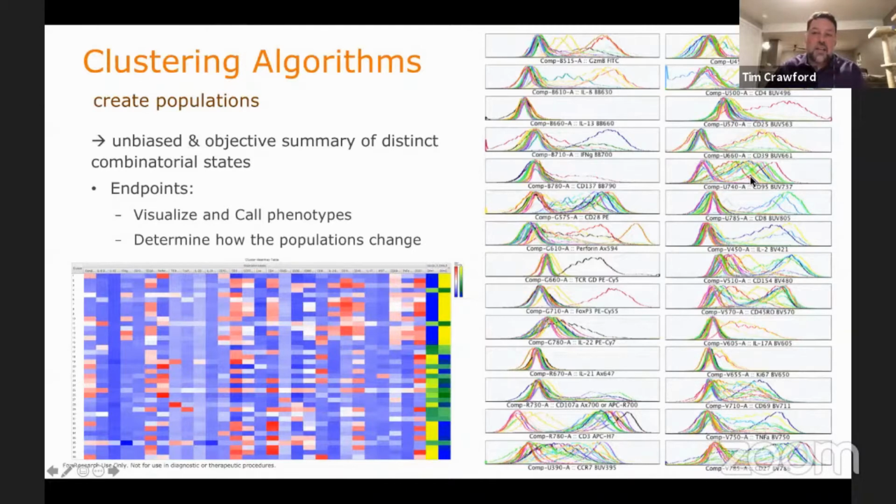And my point here is that a clustering algorithm has the ability to pull out intermediate transitional states, grouping those cells together based on a median fluorescence intensity that's different and stair-stepping through that smear. If I were to just draw a manual gate right here through my positive and negative, calling everything on the right positive, everything on the left negative, I would be cutting through those low expressing clusters and bifurcating them and maybe completely missing them with a manual gating approach.